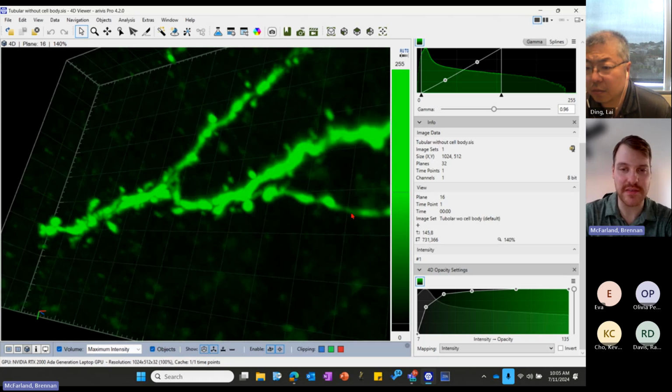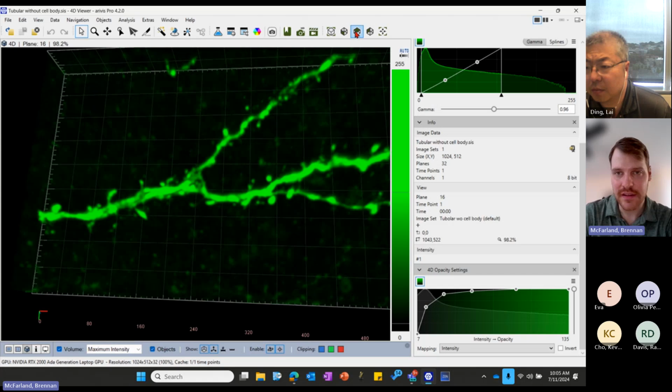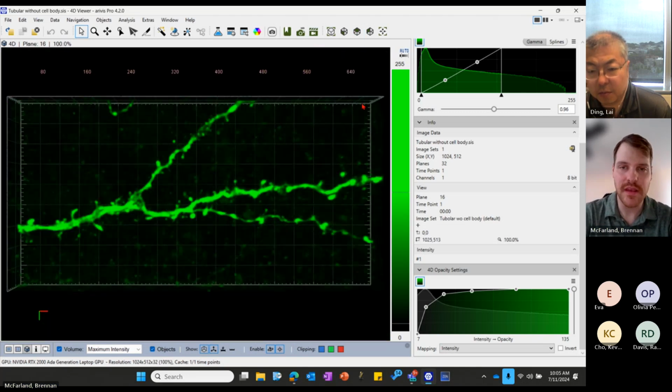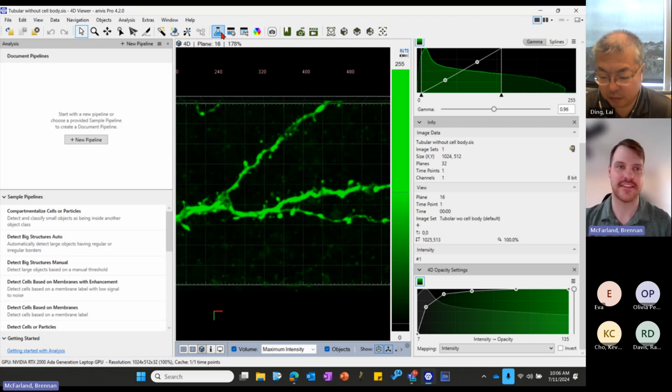And you can see that it's pretty even in staining. That's probably the most it dips and goes away in terms of intensity, but you can make out for all of this that it's just nice and connected. So this is ideal. And when we want to trace something like this, there's both an automatic tracing method and a method that you can do manually as well, and then a combination of the two. You can start with an automatic tracer using the function that I'm about to show, and then you can edit it after the fact and correct for any mistakes if needed.